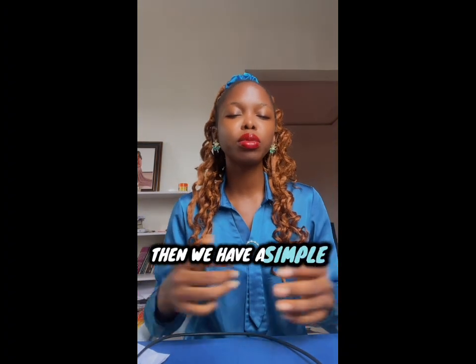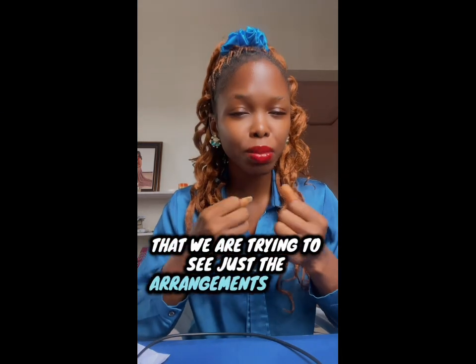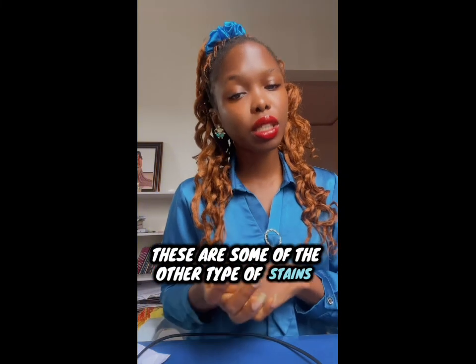Then we have a simple stain where you just use one type of stain. You can use methylene blue, when we are trying to see just the arrangement or the shape of the cell. These are some of the other types of stains that we have.